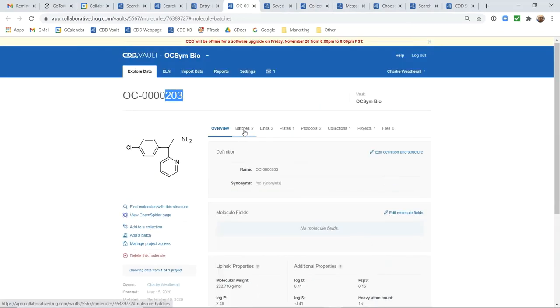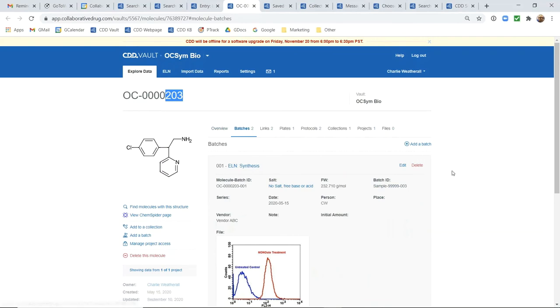You can see there is a tab to contain all of the batches. So batch 1 was actually registered from that ELN page. You can see that link here.